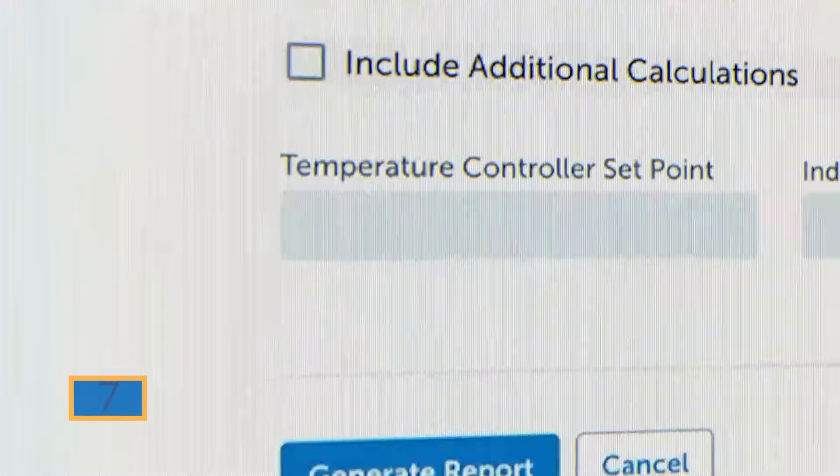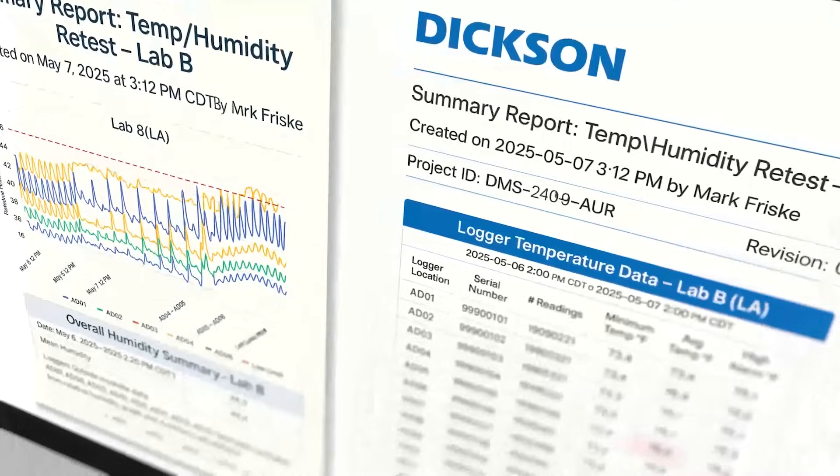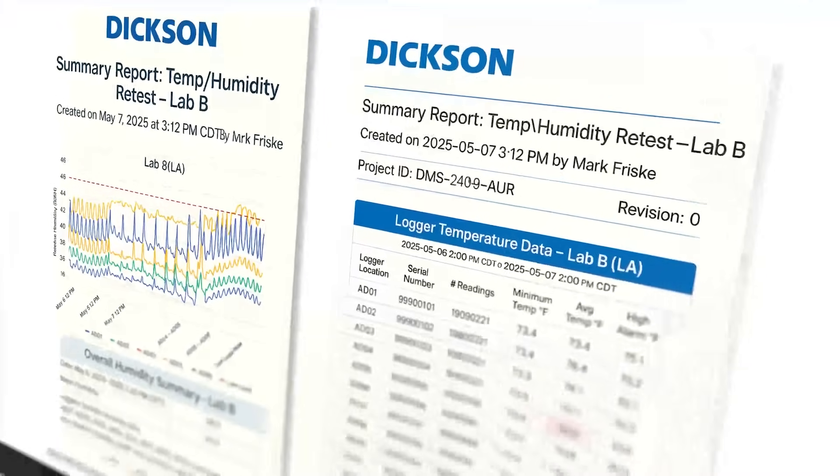Step 7: Generate your report. When your study is complete, just click one button. Instantly receive a secure, audit-proof, comprehensive report, complete with graphs and visualizations.